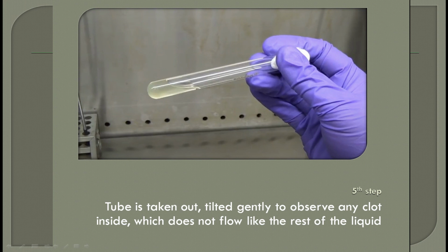What does the tube coagulase test actually test? It tests for the free form of the coagulase enzyme. So, if the bacterial colony that you emulsified and inoculated actually produces this coagulase enzyme in its free form, very good, you give tube coagulase positive.